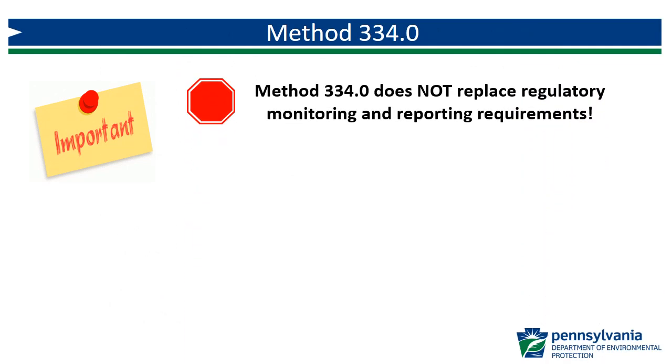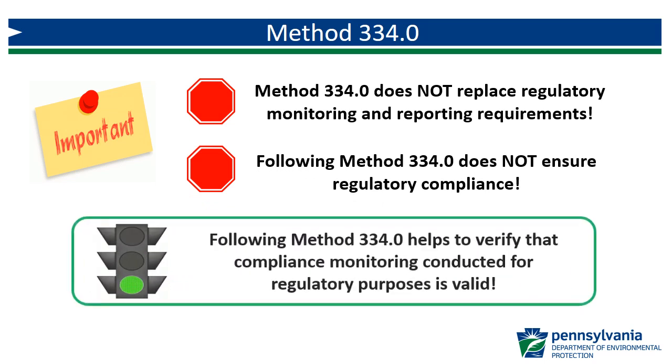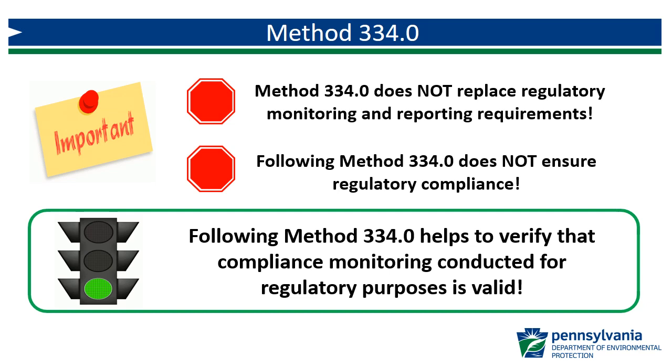It is important to note that Method 334.0 does not replace regulatory monitoring and reporting requirements, and it does not ensure regulatory compliance. But following Method 334.0 does help to verify that the compliance monitoring that is conducted for regulatory purposes is valid. Any compliance monitoring previously mentioned, entry point, distribution, CTs, or special permit condition monitoring, still needs to be conducted and reported as required. Compliance monitoring results need to demonstrate that water systems are maintaining residuals according to Chapter 109 and permit requirements.